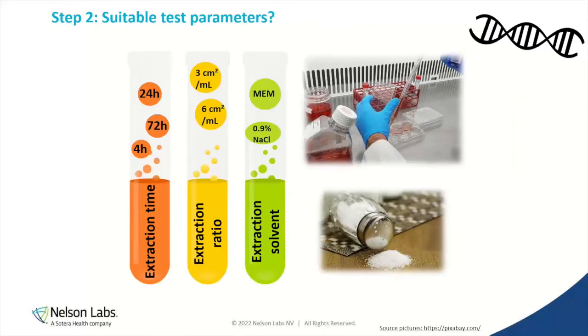Did you have something to add on that one, Lisa? No, I think it's very important that you don't always take the worst case, because we have seen some failures like that, where they only take the smallest thickness as the worst case, and then you have a failure. Ideally, you can already avoid that by doing the calculation. You don't have to go, like with the other example, first to the worst case overall extraction ratio. You can actually use the correct extraction ratio. I think regulatory there is fine. Yes, you can use that justification upfront to talk about why you prepared it that way.